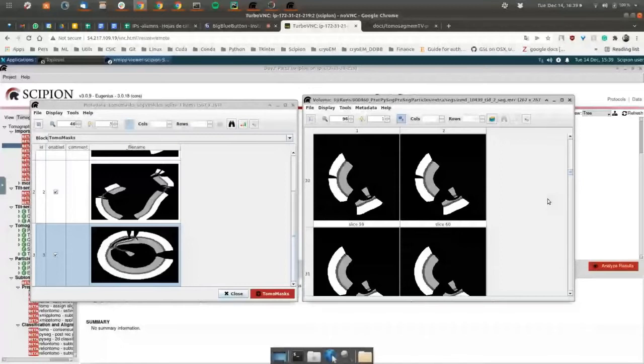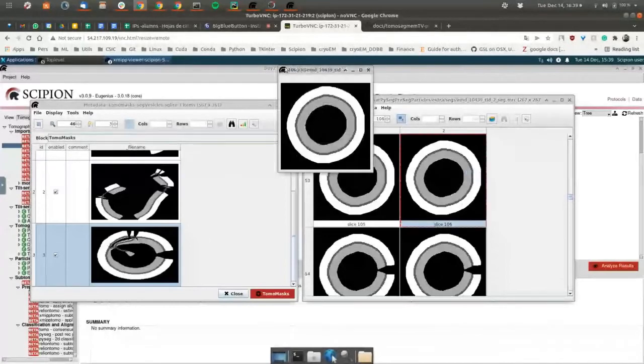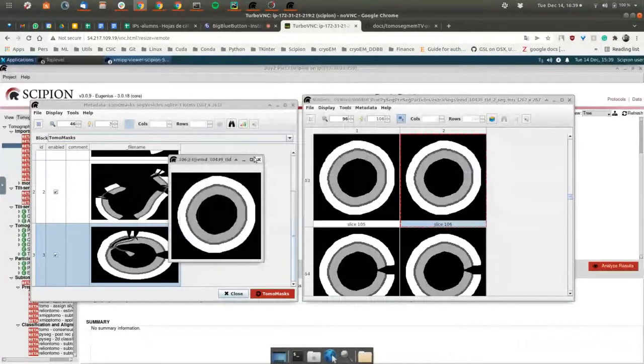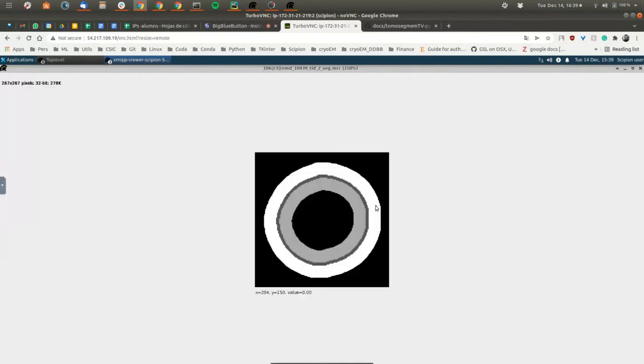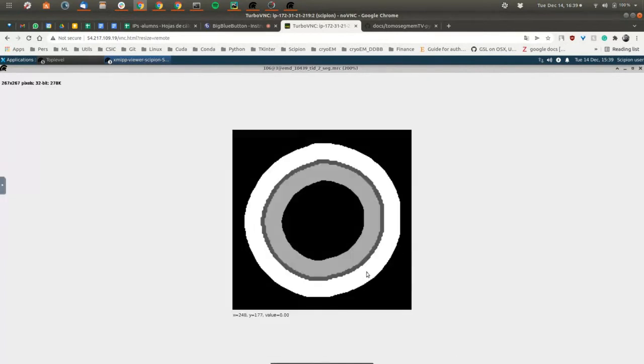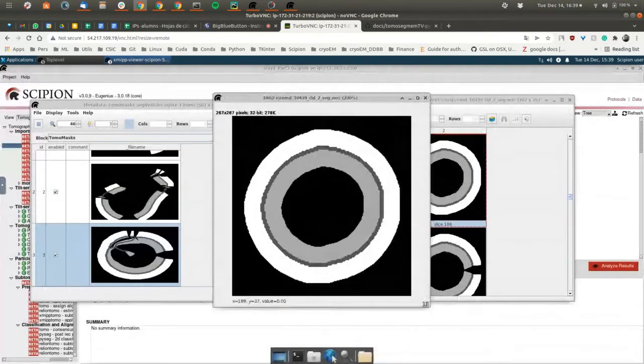Double click on it. If the maximization button doesn't work, I don't know why it isn't working on this machine, you can use the mouse wheel while pressing the Shift key on your keyboard, and that way it behaves better. Not as well as expected, but well enough. You can dynamically monitor the values from the position of the cursor.